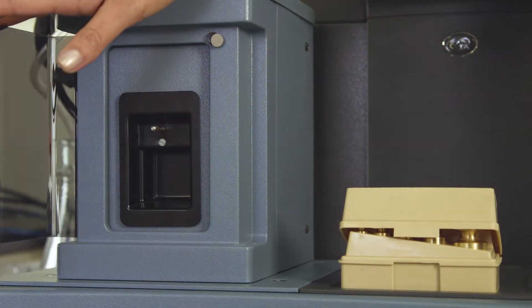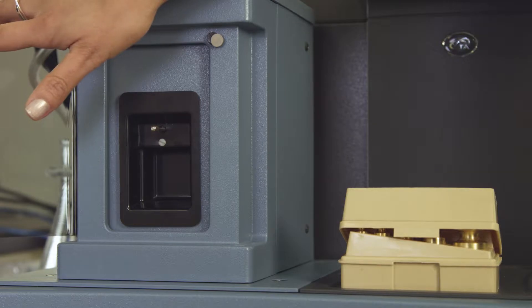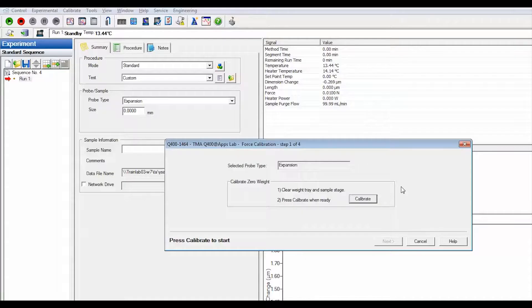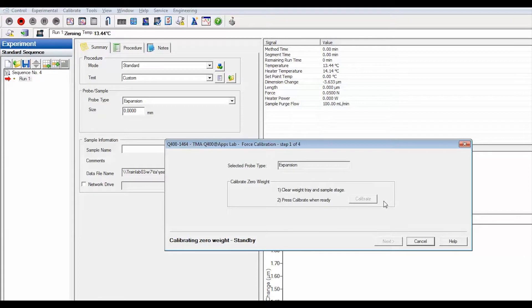Make sure the weight tray and stage are cleared. Click calibrate. Wait for this step to be completed and select next.